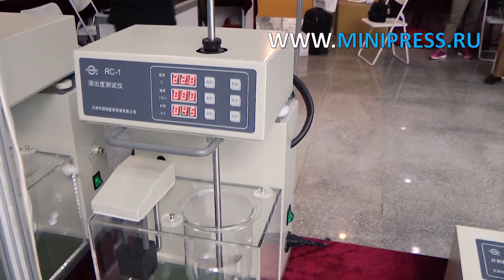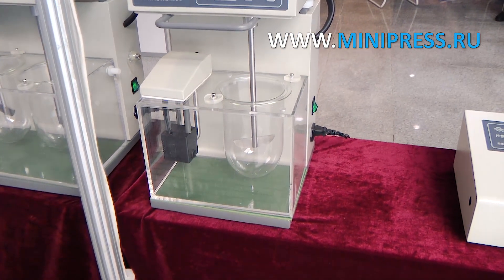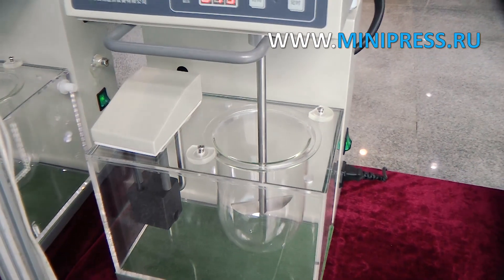We provide detailed instructions for setting up the dissolution analyzer. Dissolution analyzers are inspected and tested in production before shipment. Completeness and performance is guaranteed.